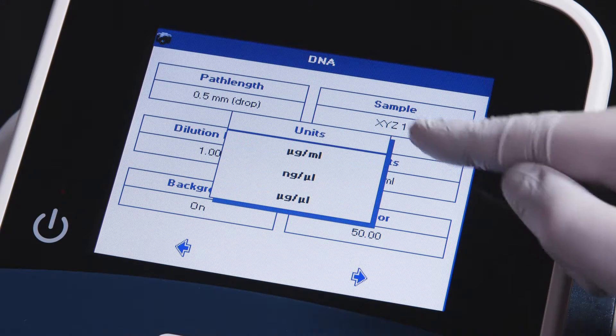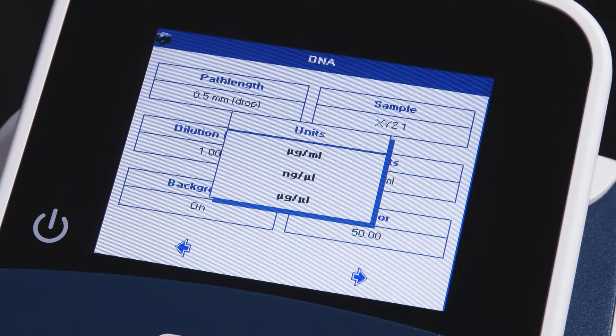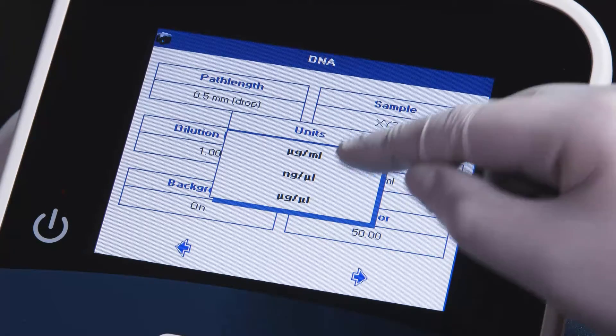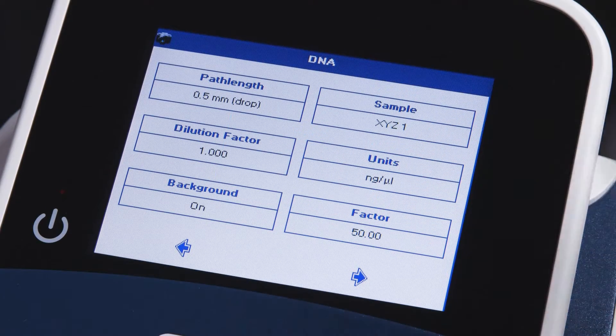You may also change the units referenced. You may select micrograms per milliliter, nanograms per microliter, or micrograms per microliter. We'll select nanograms per microliter.